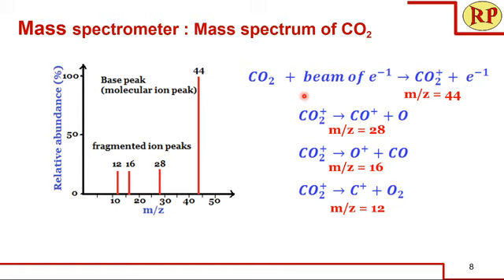So it will be complex with the complexity of the molecule or the compound present. We can also have a mixture of compounds, but if you have a mixture of compounds, it has to be coupled with a chromatographic column like GC or HPLC, and it has to be separated, and then it has to enter the mass spectrometer. That is, you have GCMS, LCMS and so on.